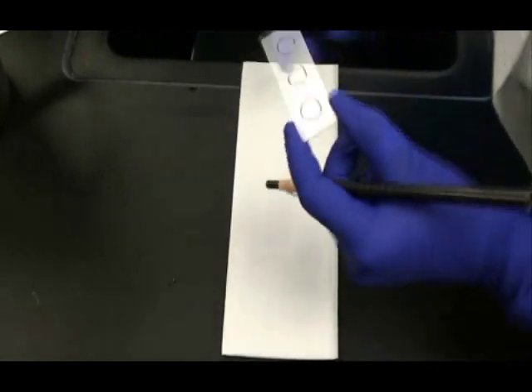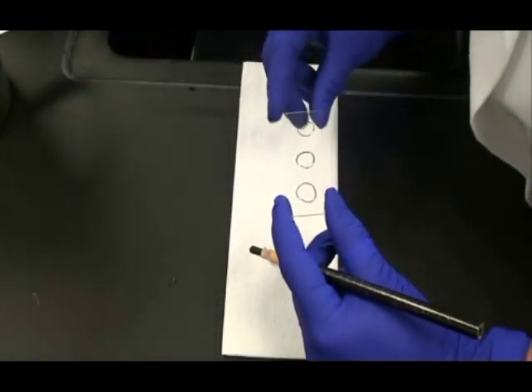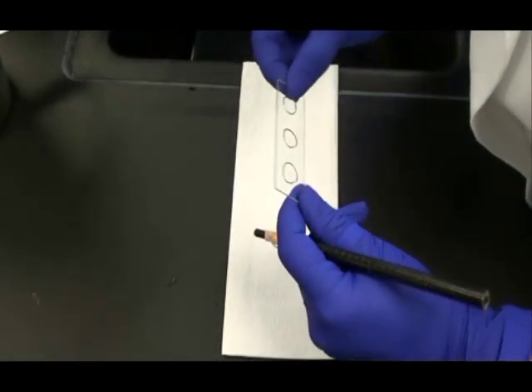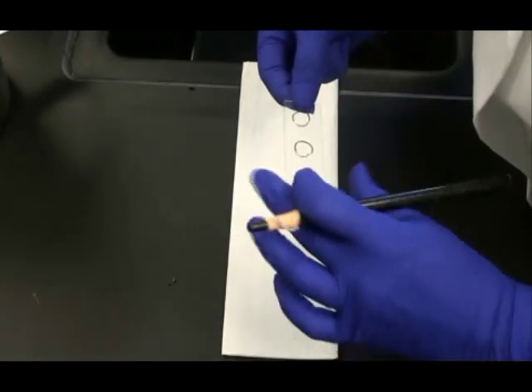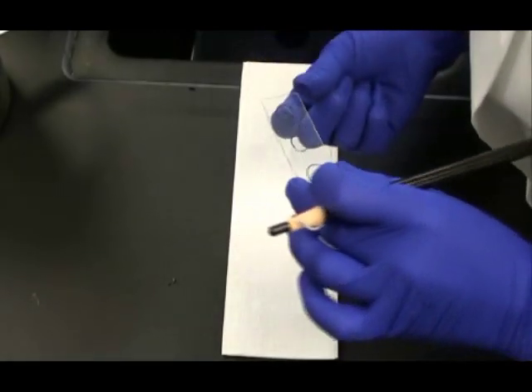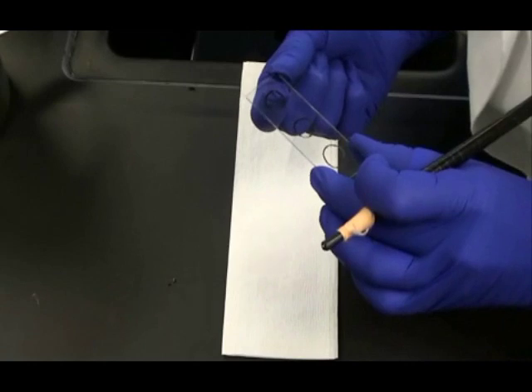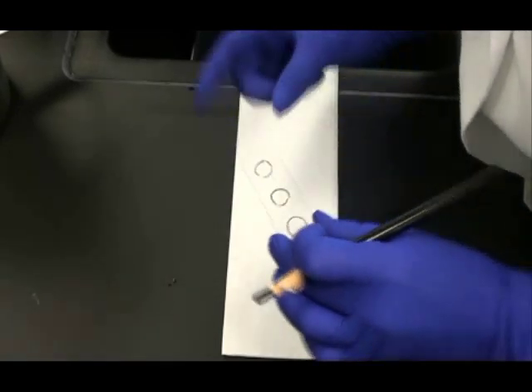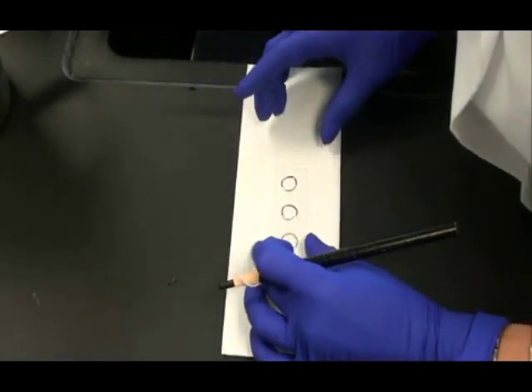The center circle is for the unknown and the two outside circles are for the controls. It's a good idea to flip that slide over so the wax is on the bottom. Then it won't mix with my bacterial sample and it's an easy way for me to tell which side is up.